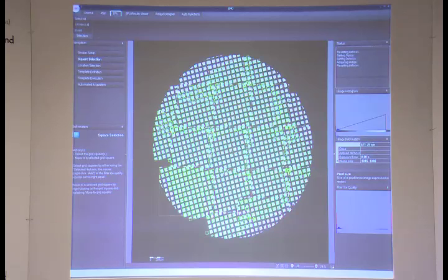Okay, so this is essentially how our EPU program works. We have a grid which is in the microscope, and at a low mag with a low electron dose, so low that we can't really detect it, we basically take images across the grid, and then we stitch them together. So we have what we call an atlas. So this covers the whole grid.